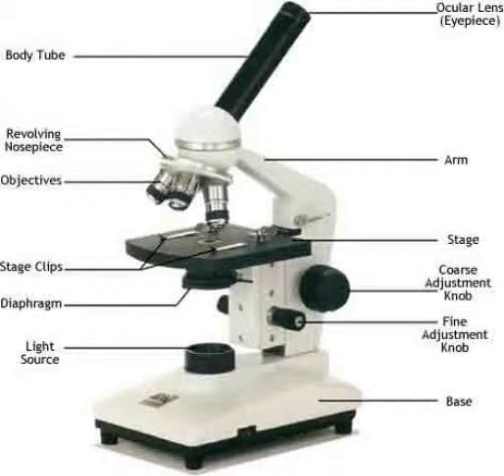Because of this, microscopic measurements are often expressed in microns or micrometers. 1 millimeter equals 1,000 microns. To convert your diameters to microns, multiply them by 1,000. Number 6, make a drawing of the ruler in the field of view on high power. Include size estimations in microns.